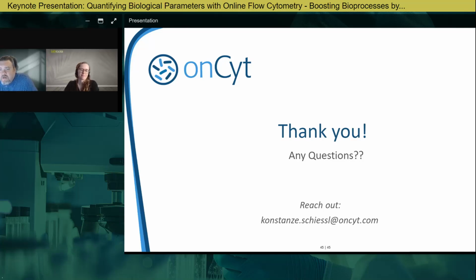All right. Let's see here. The next one we've got is, where do you see the biggest use case for online flow cytometry in monoclonal antibody production? Yeah, that's to be found out. There are many types of staining assays in principle available. And then what's the biggest use case? It will depend on the biggest need from people who run these bioprocesses.